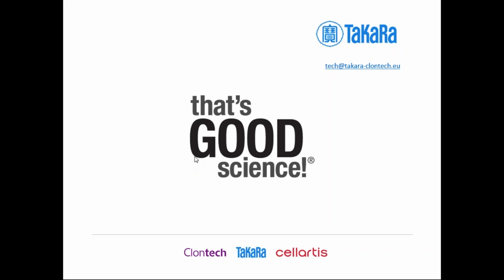Let me just check whether there are more. One question for the plant cells. So whether we are developing kits for plant cells. So unfortunately for the delivery part, no, we don't have anything for plants or bacteria. It's all for mammalian. What you could use again are the upstream screening kits and the downstream mutation detection or genotyping kits, because the Terra enzyme works with plant samples. But for the delivery part, for the moment, we don't have anything.